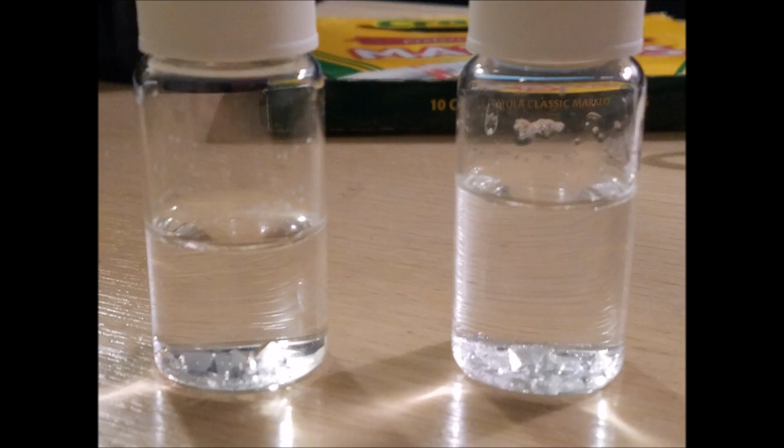As you can see in these vials, there are now many crystals, ranging from about 6 to 8 in each vial, and each of the crystals, while varied in size, ranges from about 3 to 6 millimeters. You can see that they are cubic in shape, meaning they look like little boxes. Also, they're transparent.